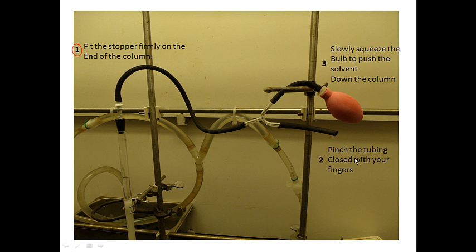Step two, you're going to take your fingers and pinch off that tubing so that when, in step three, I take my hand and squeeze this bulb, the pressure will actually push the solvent down the column. Okay. So you want to squeeze the bulb slowly to push the solvent down.